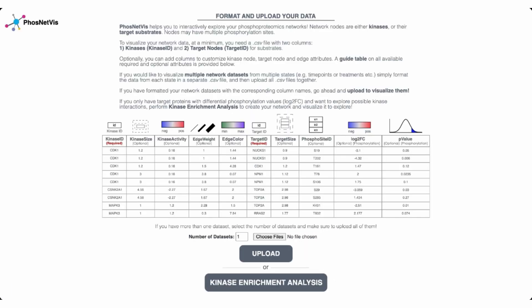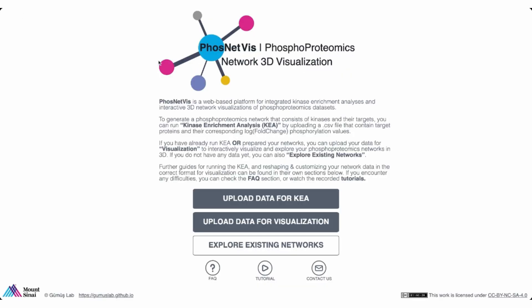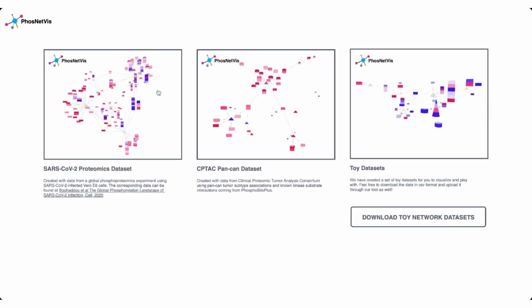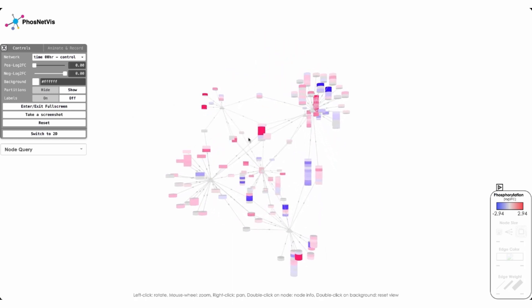And here, once the kinase enrichment analysis is run, then we can upload this information to the network visualization section. And in network visualization, the input file, all it needs is a kinase ID and a target ID that are required. All the rest of the attributes are optional. These optional attributes include kinase size, kinase activity, edge weight, edge color, target size, phosphosite ID, log twofold change of phosphorylation, and p-value of phosphorylation. And the user can input one or more data sets. And then, once the network visualization is run, I'm going to show you, for the purposes of the demo, an existing network.